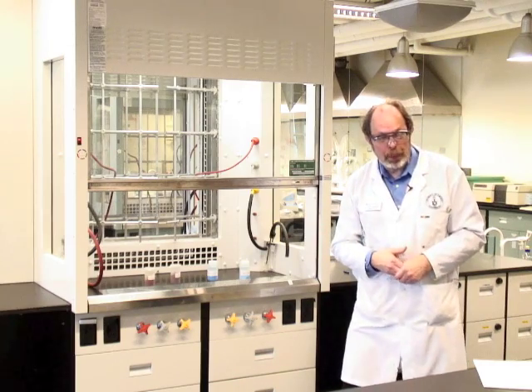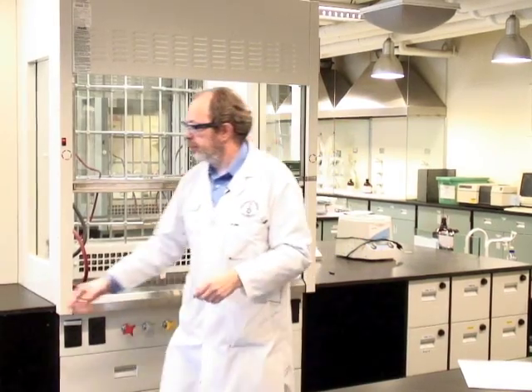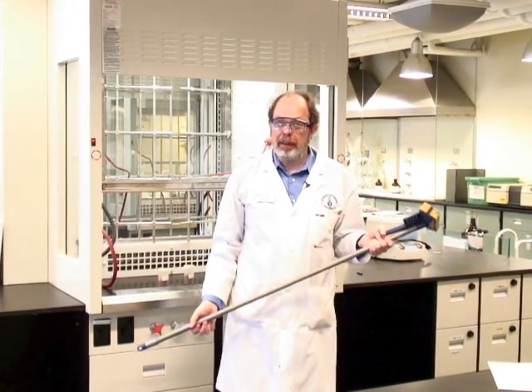We have a very simple rule in the lab: you make a mess, you get to clean it up. So if you have a water flood, we have a mop that you can use to remove the puddle from the floor.